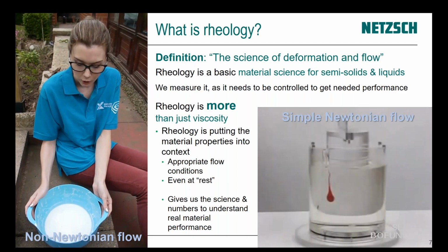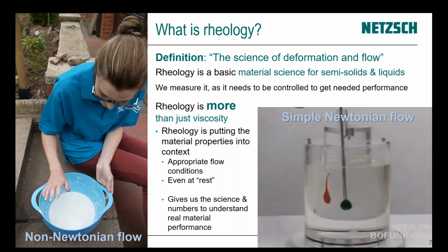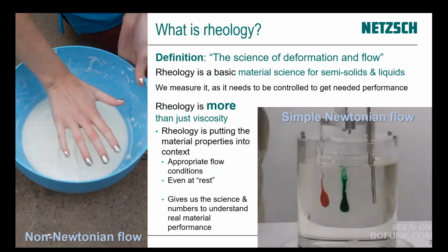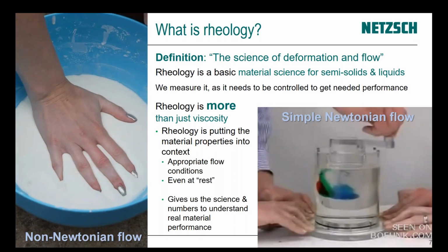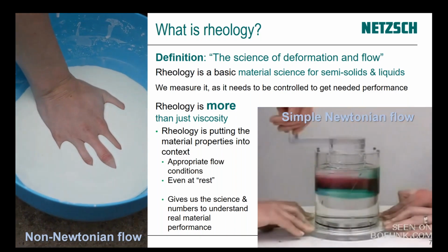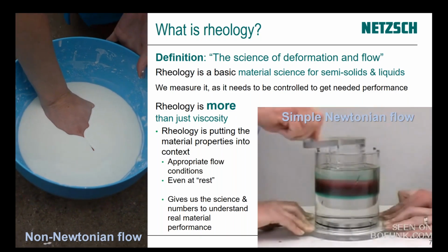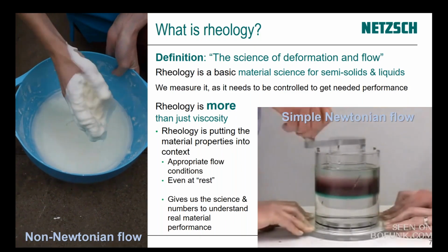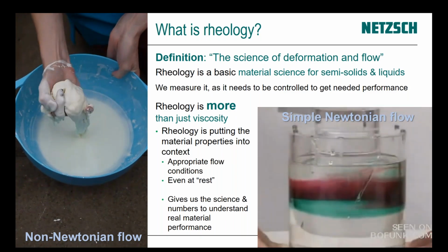So to start off with, right at the beginning, what is rheology? Quite often we have to talk about rheology as more than just viscosity, and that's a good place to start. Rheology, we will discuss viscosity. But really, it's nice to think of rheology, and the definition is a good place to start: the science of deformation and flow.